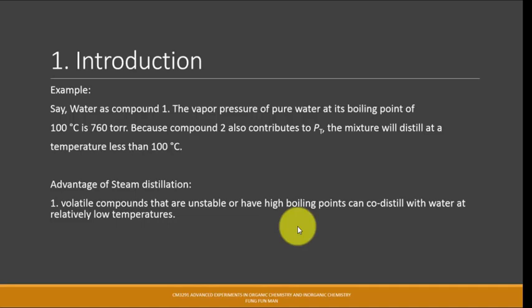And the second advantage is you can also avoid the decomposition that might occur at the normal boiling point of the compound of interest. So once again, the two advantages of steam distillation are that volatile compounds that are unstable or have a higher boiling point can co-distill with water at a relatively low temperature. So it comes out together with water.